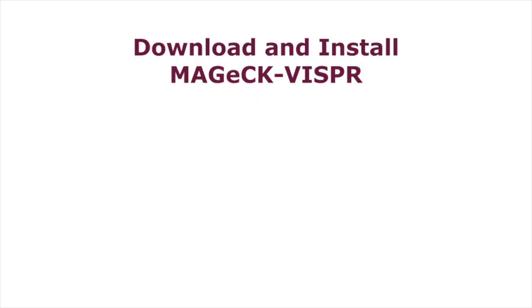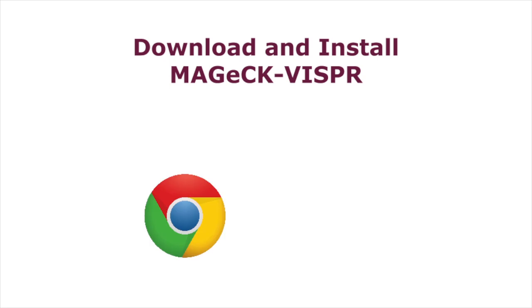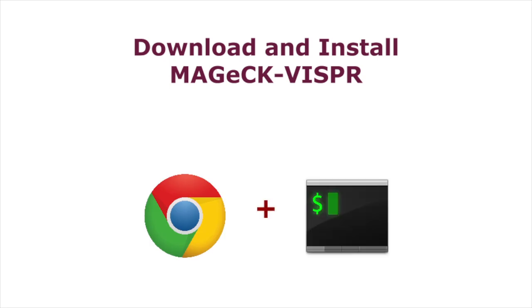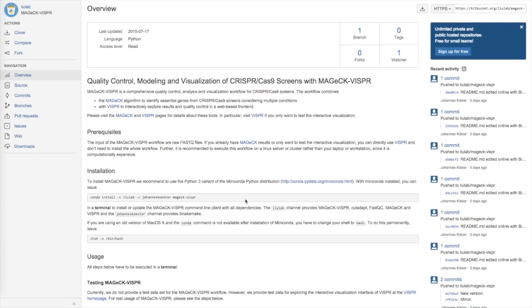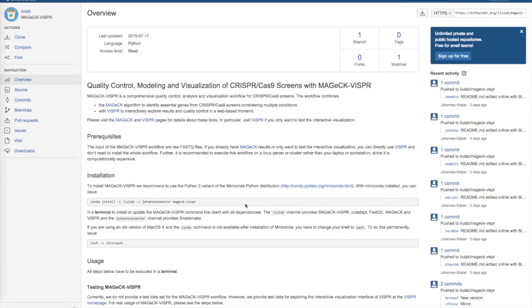In this tutorial, you will learn how to download and set up the MAGecK-VISPR workflow on Unix machines. To do this, you'll need access to the internet and to a command line. We recommend that you follow along and complete each step on your machine as it is being demonstrated in the video. All links can be found in the video description.